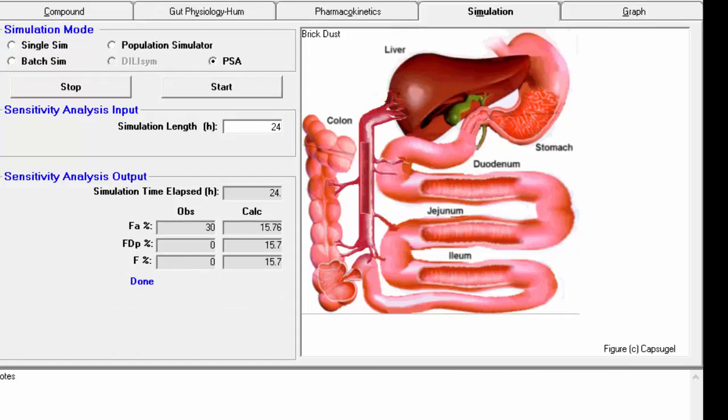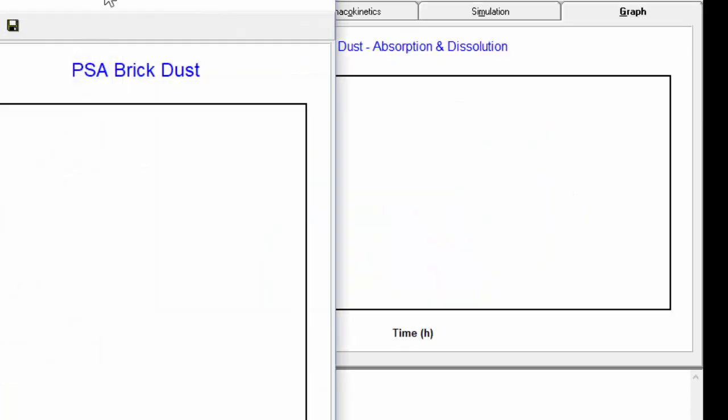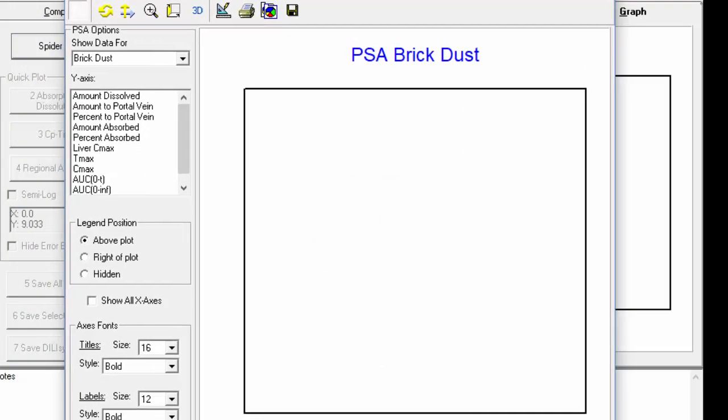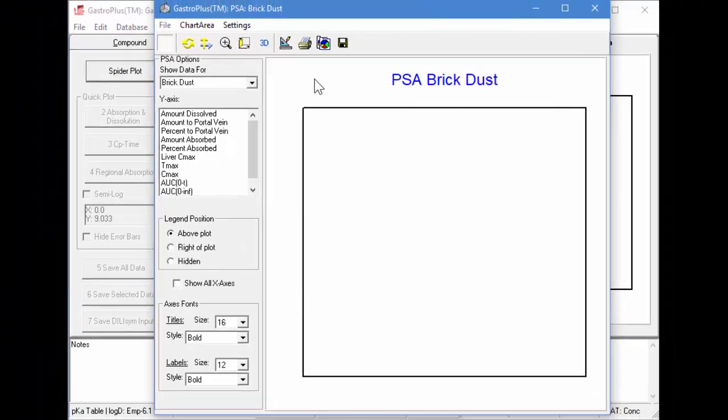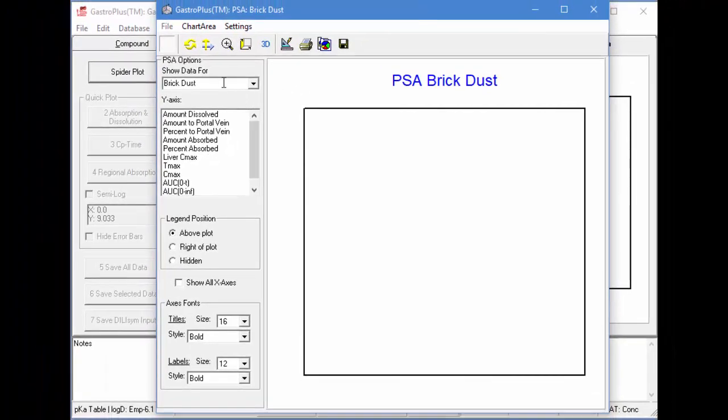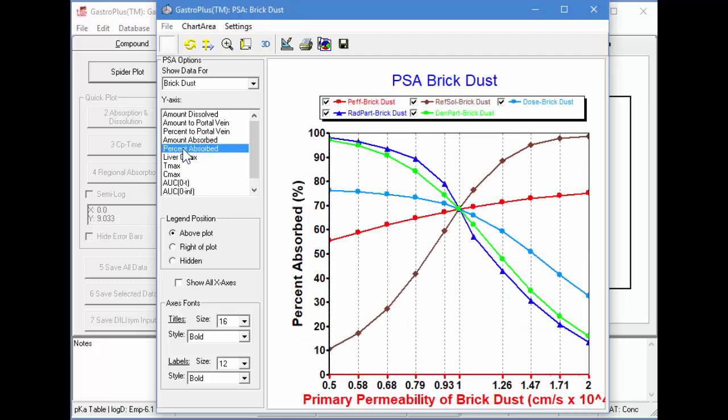Okay, now the simulation is finished. So I'll go into the Graph tab and click on Spider Plot, which brings up this dialog box here.